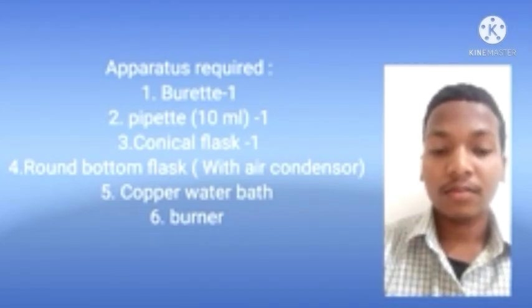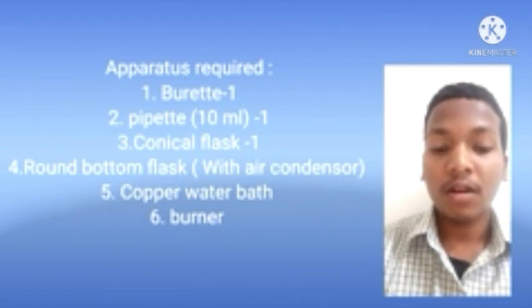Apparatus required: burette 1, pipette 1, conical flask 1, round bottom flask with air condenser 2, copper water bath, and 2 burners.